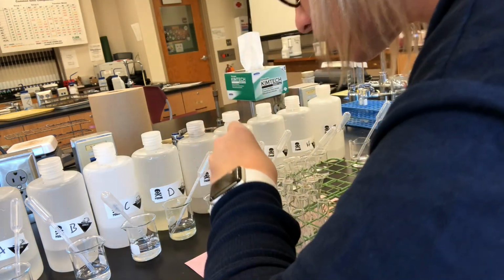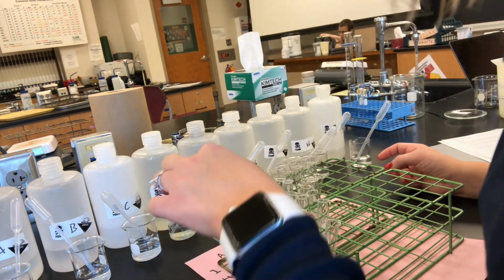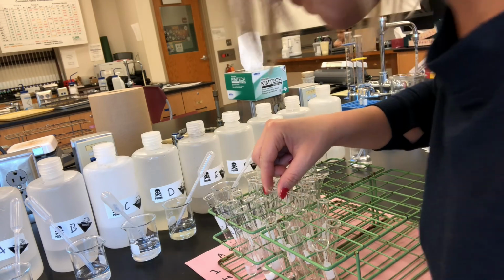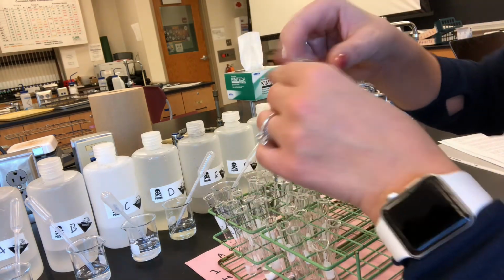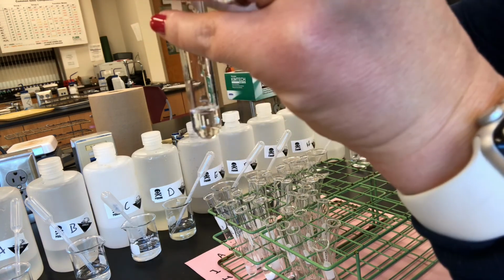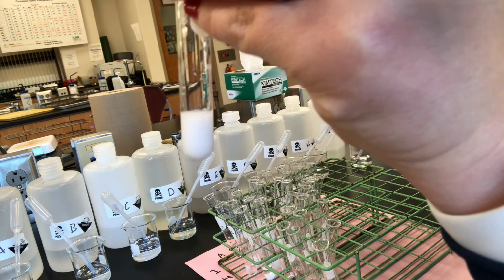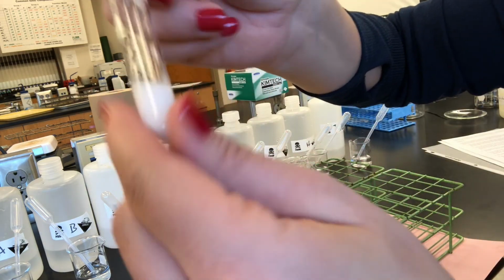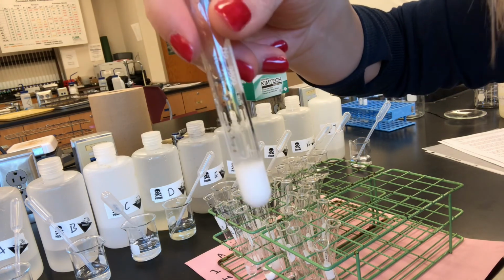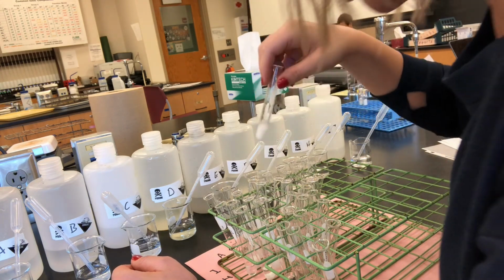There's a couple of colored ones in here. That'll give us a color change. That'll give you a big hint on what's going on. All right, so C, as great as making my eyes go wonky. C and G, I believe we are on. So C, and I'm going to add G. Ooh, look at that one. It's not fluffy like the other ones. It's definitely just like a milky white type precipitate there. So C and G.